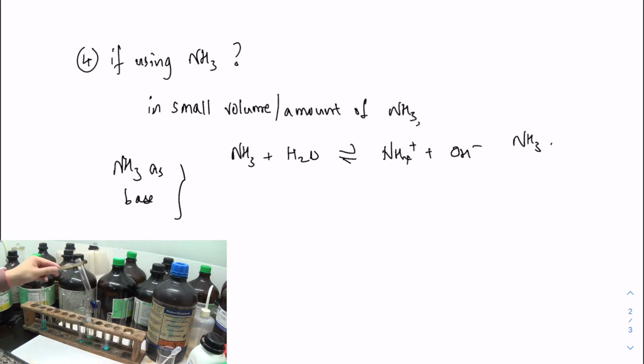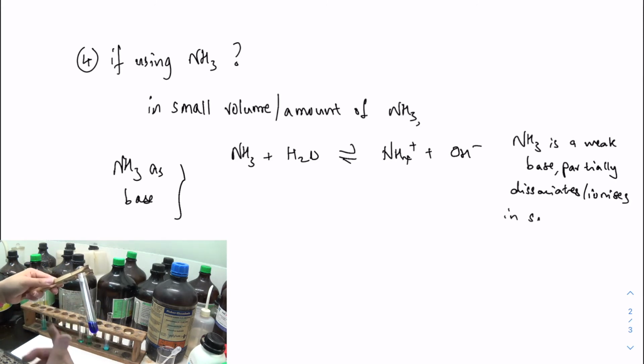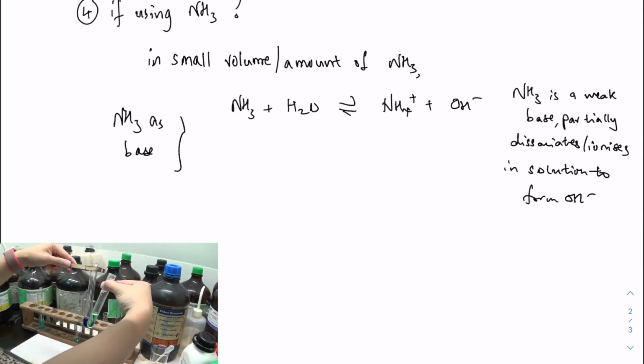It's still a 2+ charge complex, and this is a deep blue or dark blue solution. Very distinctive color to indicate the presence of copper 2+. So this complex has 4 ammonia and 2 H2O molecules with a 2+ charge. I could drive it towards this green solution that is copper with 4 chloride around it.